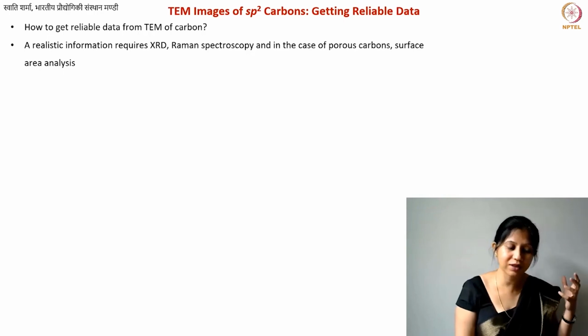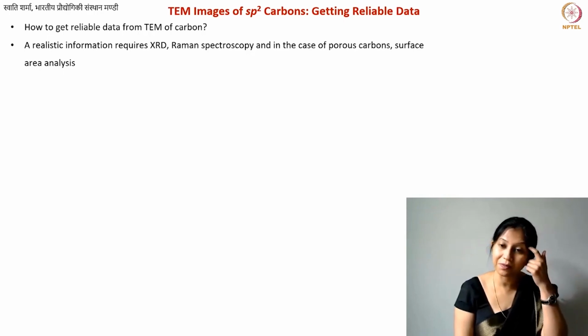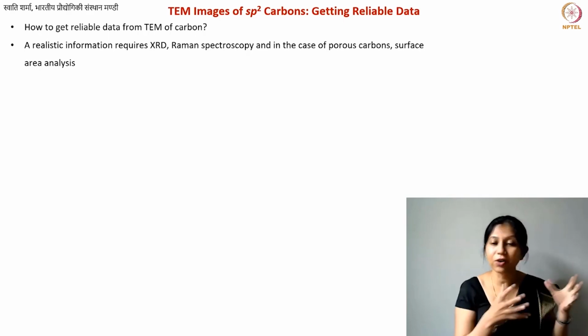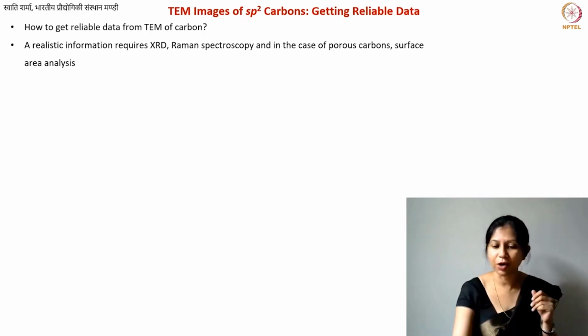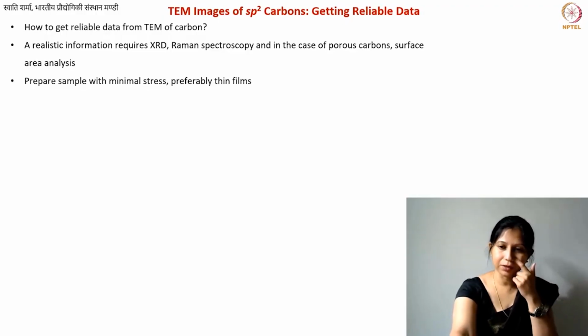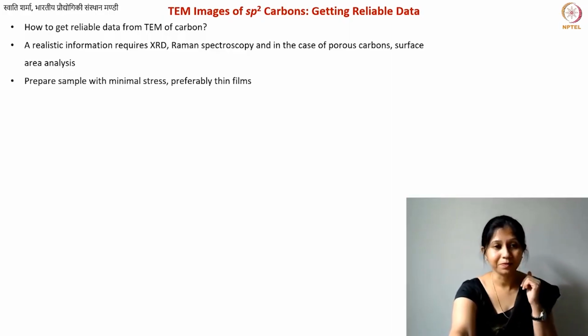Okay, this was a question for a very long time, that we have some sort of pores, but they are closed because the material is impermeable. So all of this information we can definitely get from TEM imaging, but it needs to be correlated with the other information that we have about the material. Okay, so here I'm telling you the techniques that will help you get reliable data.